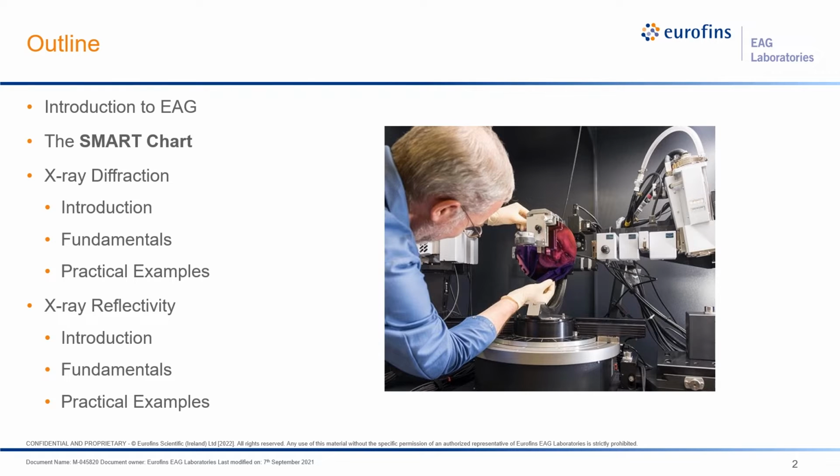I'll begin this webinar with an introduction to EAG, followed by a closer look at our Smart Chart reference material. After that, I'll dive into XRD with a brief overview of its uses, a high-level look at the fundamental concepts behind the technique, and I'll finish with a few practical examples to show off what it can do. Then I'll repeat this structure for X-ray reflectivity as well.